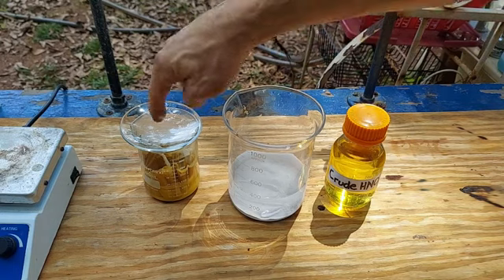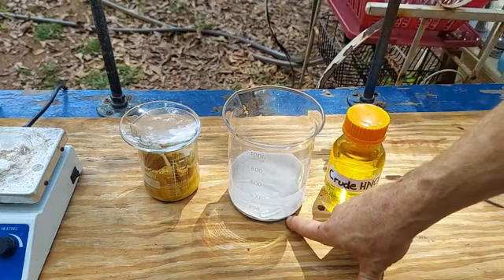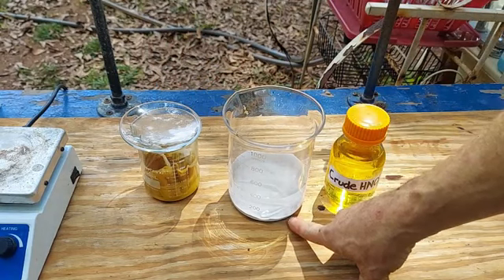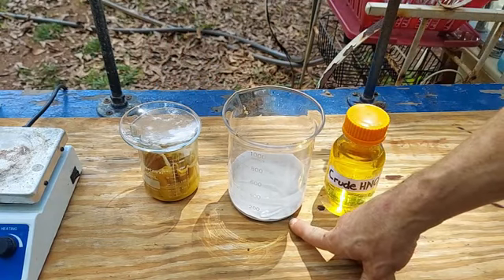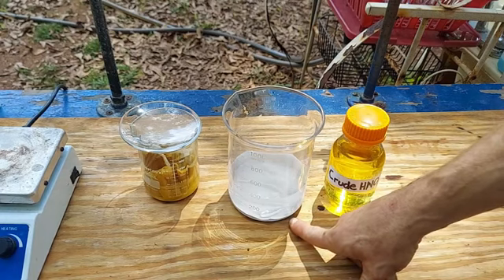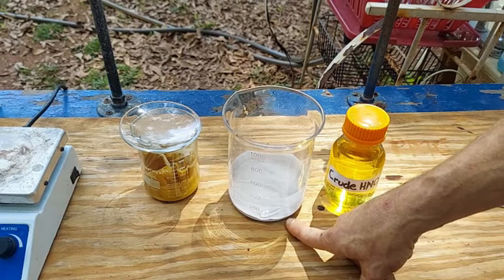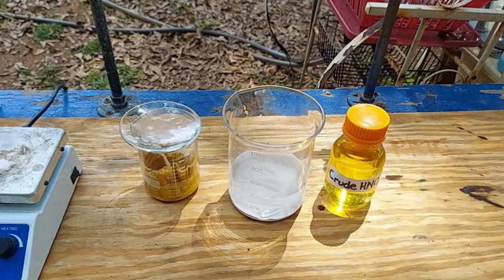This is all of our mercury that we recovered as the oxide. This is all the stuff that was precipitated out, plus that dirty mercury that I added to it. This had been sitting for several days, and it had all kind of consolidated into one big blob. But for some reason, it appears to have broken up and is much more difficult to see now. But there are little blobs of the metal under there. I'm wondering, if it sat for a very long period of time, how much of it would eventually consolidate down into a nice liquid blob.